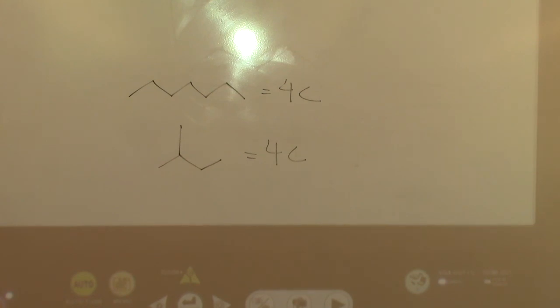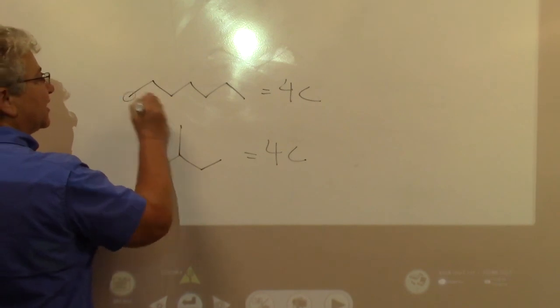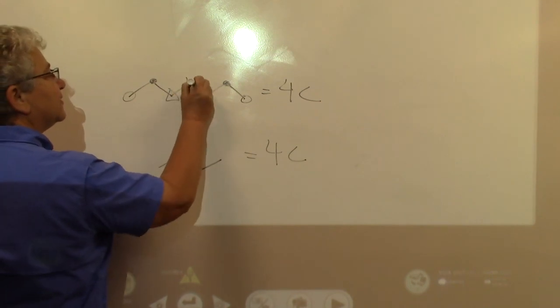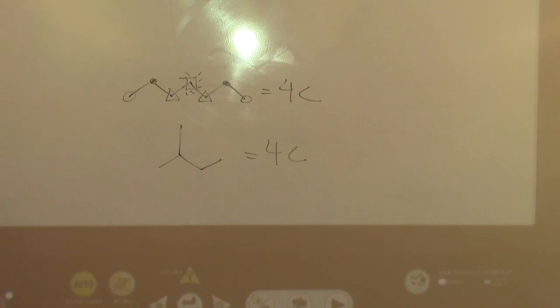All right. So welcome back. Hopefully you could see that there were 4 different carbons in your heptane molecule. That's the same as that. That's the same as that. That one is the same as that one. And that one was different. So there are 4 there.